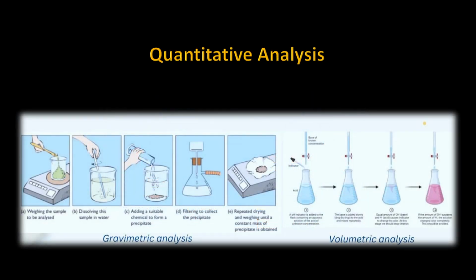The second is quantitative analysis. This method is conducted to determine how much you have, which relates to the concentration of the elements of interest within your sample.